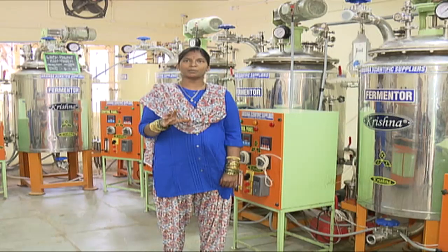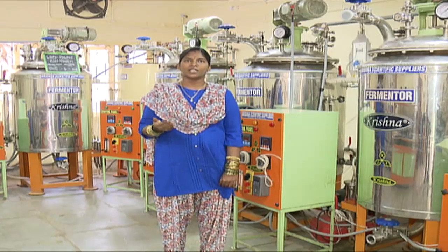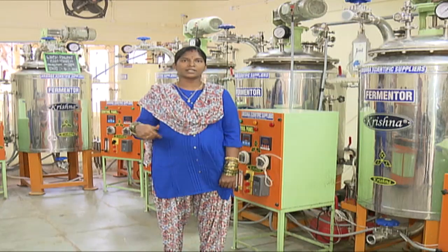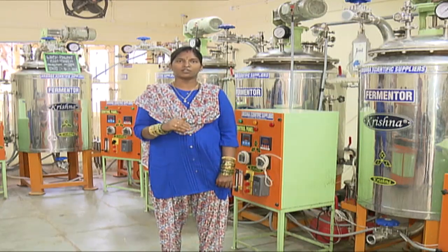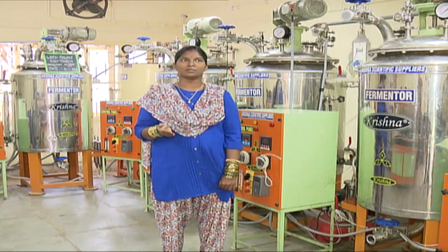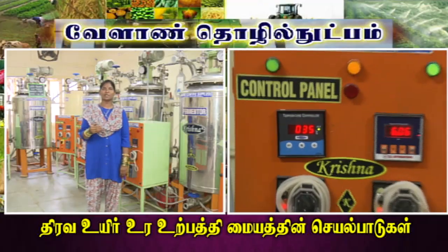We preserve the culture in the refrigerator for 3 days for further use. There is a slant culture, bottle culture, and fermenter — we follow the same procedure. After full sterilized conditions, we will do bio-fertilizer production.